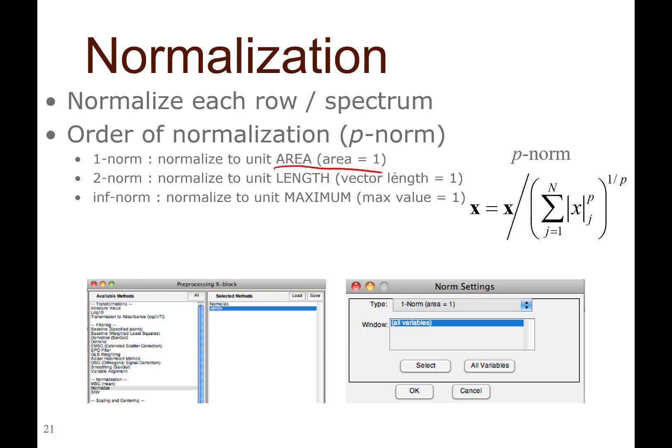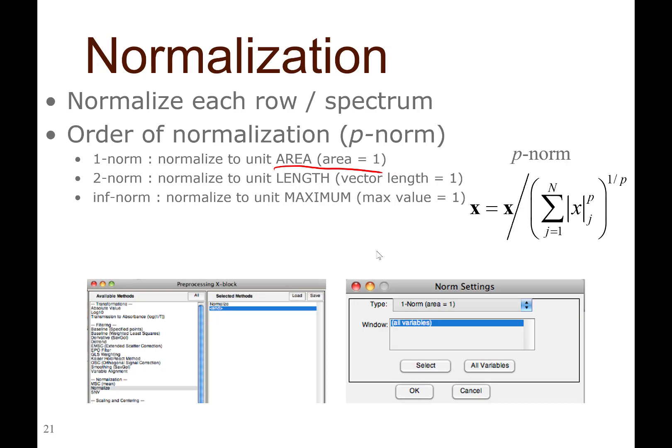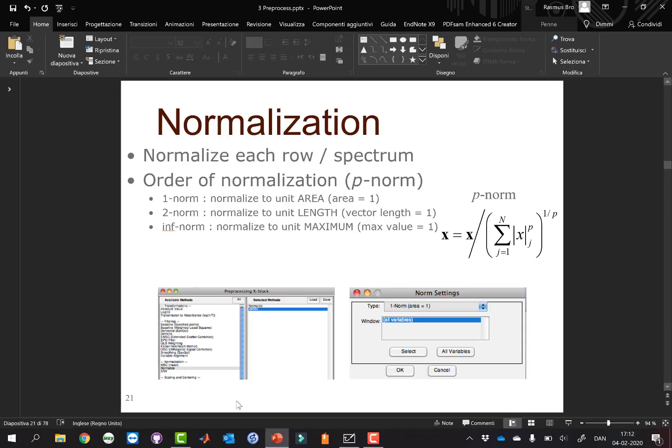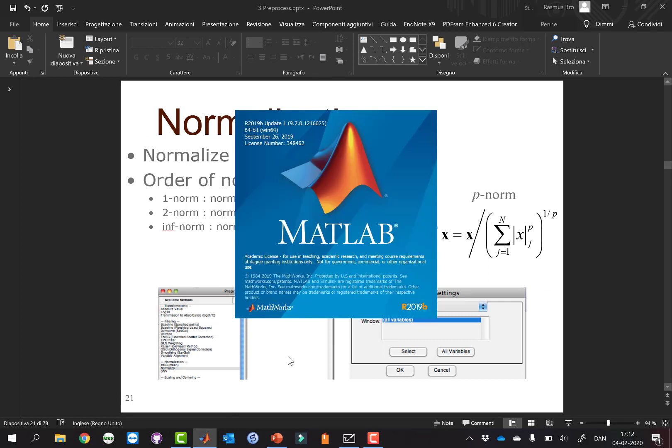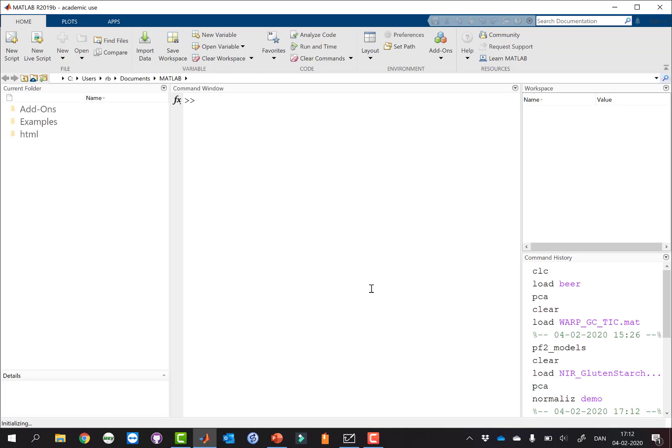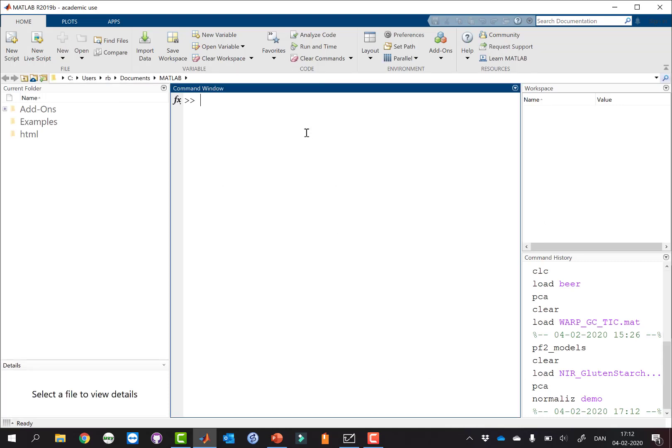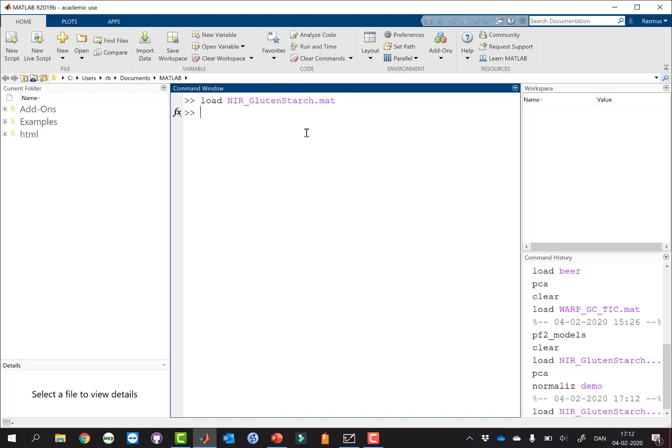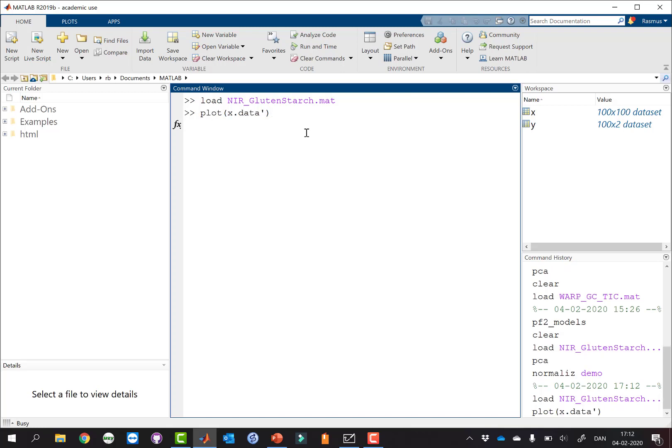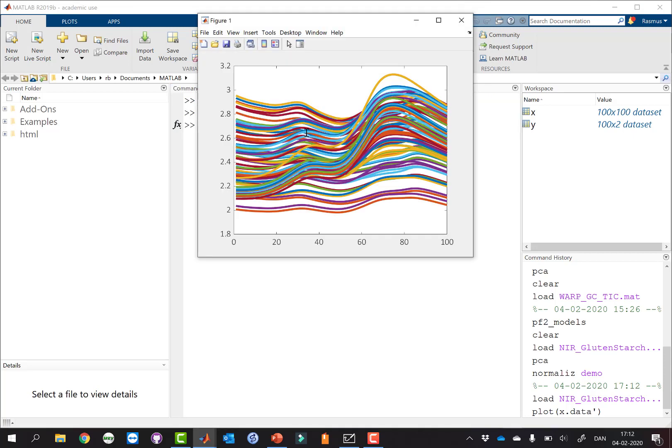Let's try and take a look at some of these in MATLAB. Let me open MATLAB and let's take a look at a spectral data set, and then we can see what the effect is of changing these norms. This is a data set consisting of a hundred samples, and they've been measured with near-infrared spectroscopy.